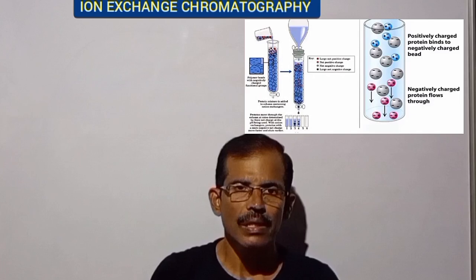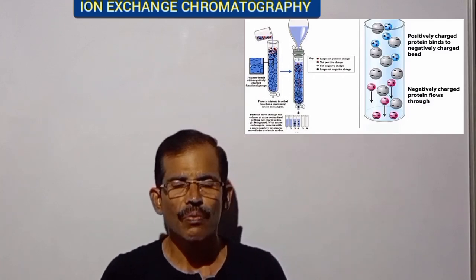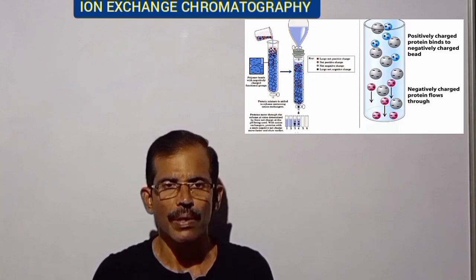Friends, today we shall discuss the principle and applications of ion exchange chromatography.